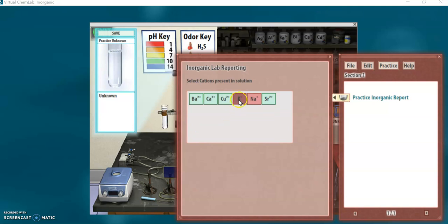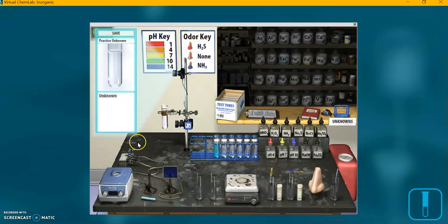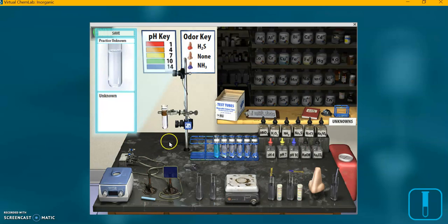Okay, that's interesting. I think what this means, the dark red is the wrong guess that I made, potassium. I think the lighter red or pink, whatever that is, I think that one shows what the real answer was. Okay, I'm just clicking back on the stock room to go to the next part.